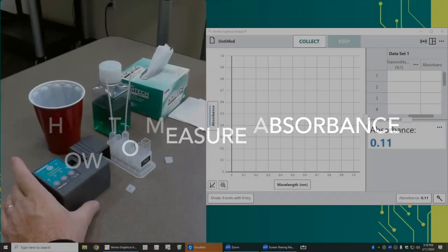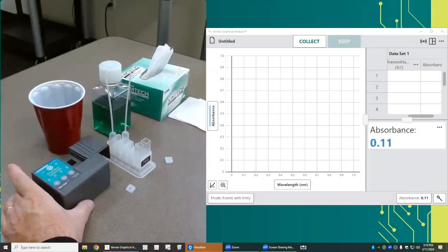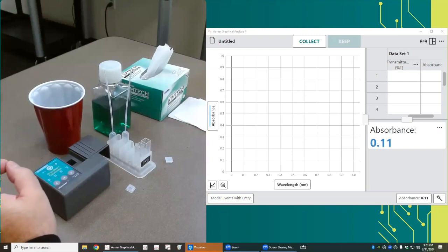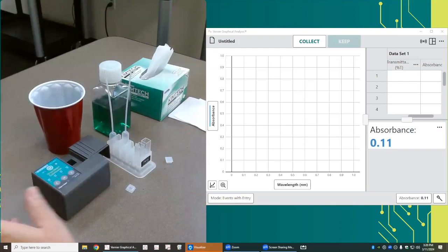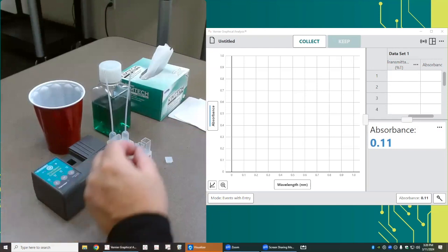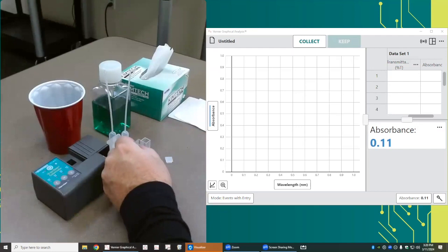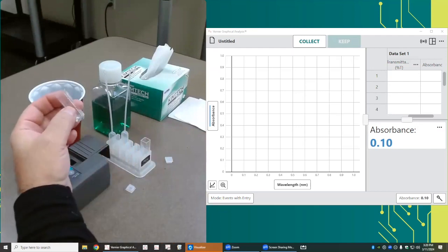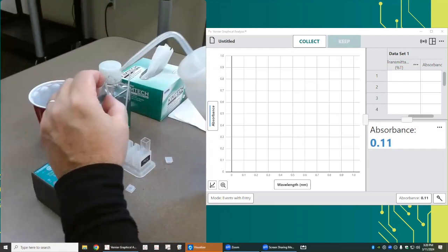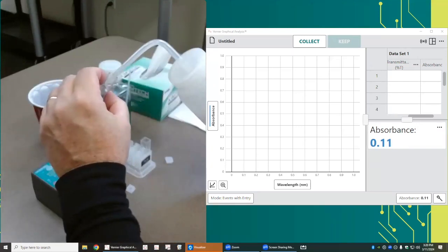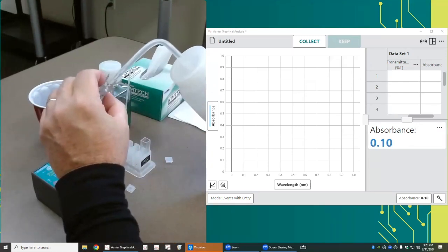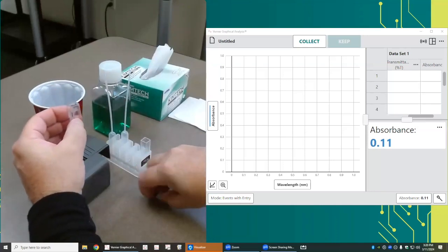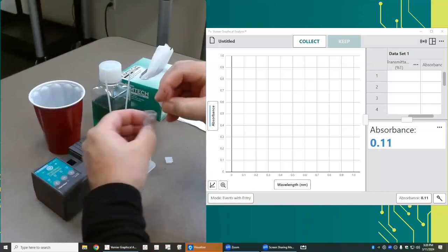What we would like is for the initial reading when there's just the solvent in there to read zero. So I'm going to take a cuvette and fill it three-quarters of the way full with water, and I'm going to put a cap on it.